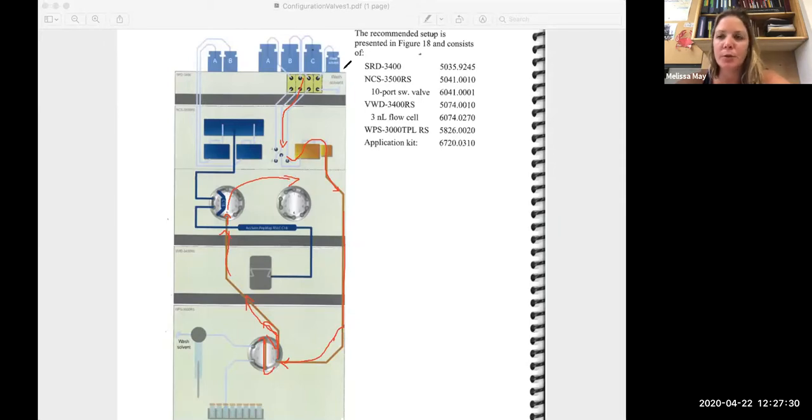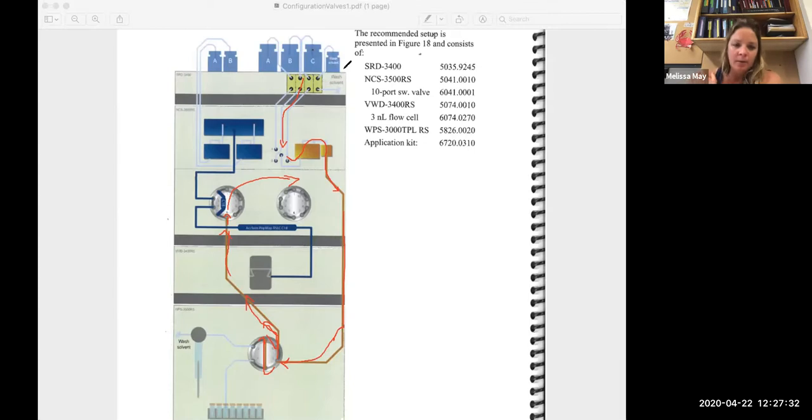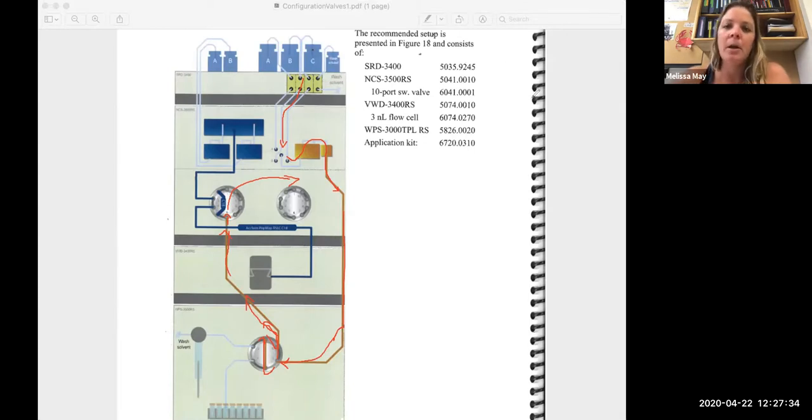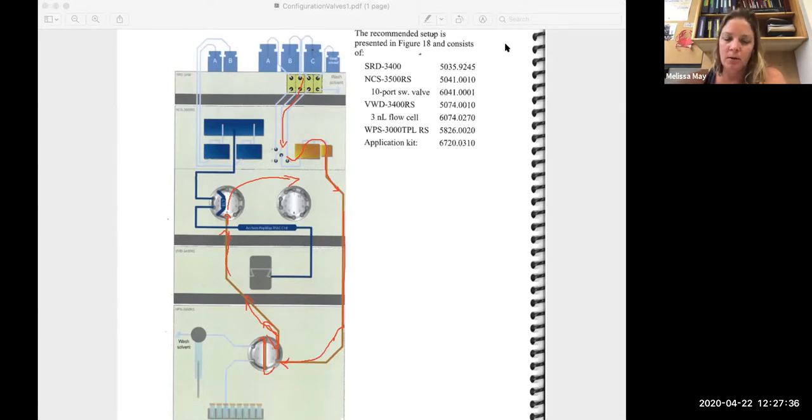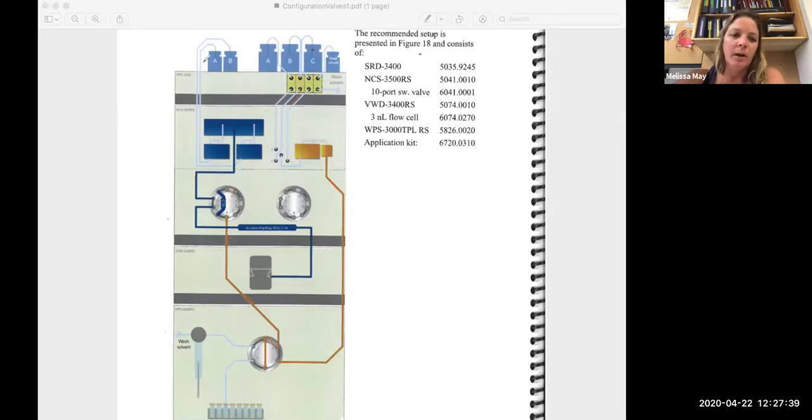And the flow rates are high enough that you'll go through an appreciable amount of it over time. So to kind of conserve that, we turn it off for the nano pump.